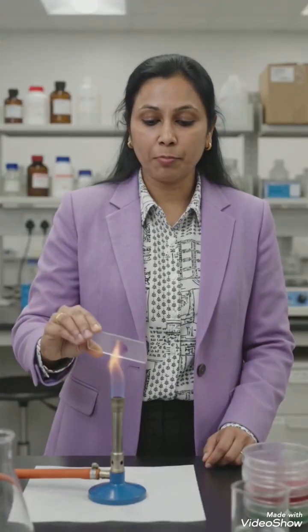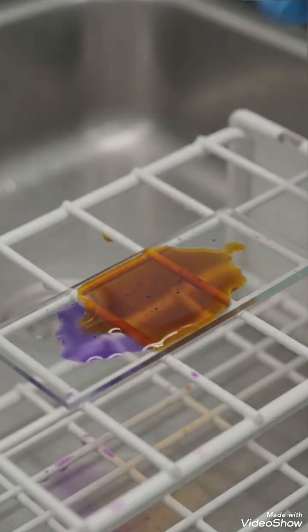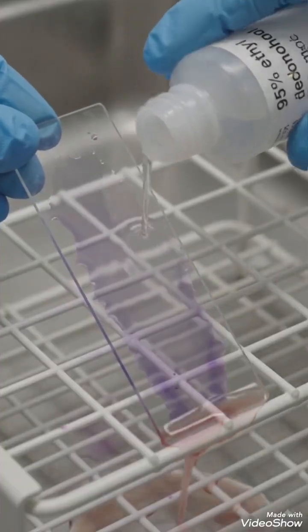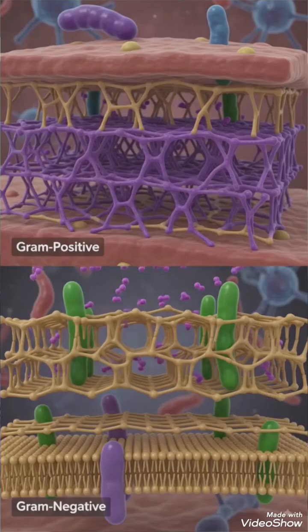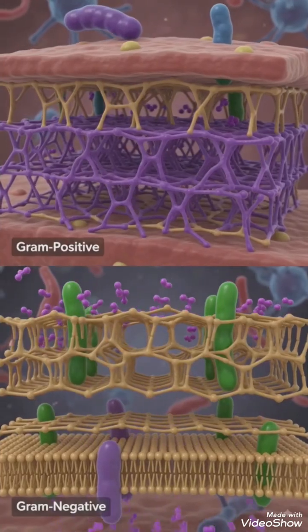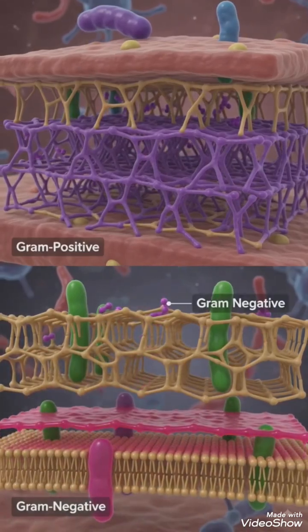Prepare and heat fix smear, add crystal violet and wash. Add iodine for 1 minute, decolorize with alcohol, counterstain with safranin. Gram-positive bacteria remain purple because thick peptidoglycan retains crystal violet. Gram-negative bacteria become pink because alcohol removes crystal violet and safranin stains them.